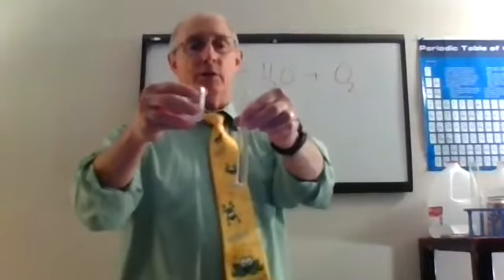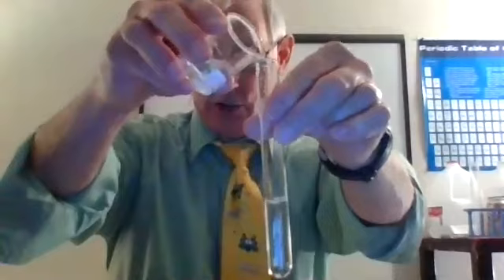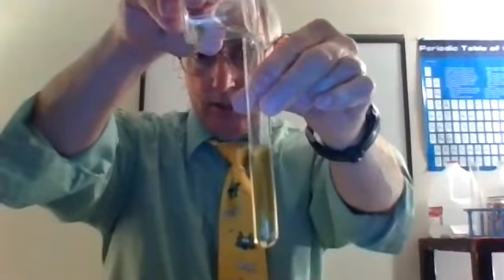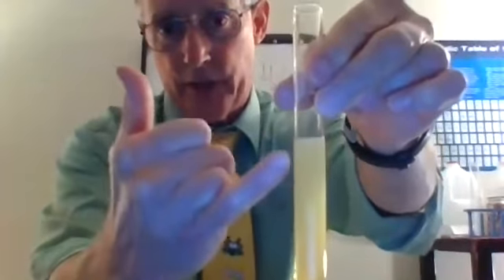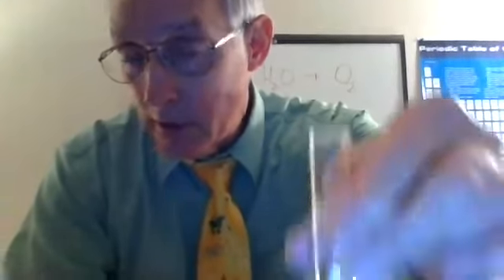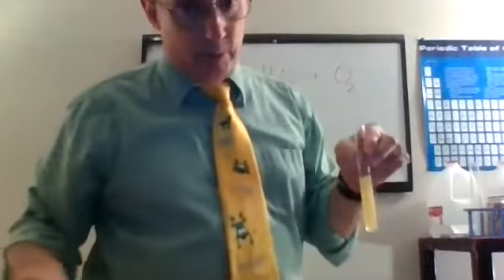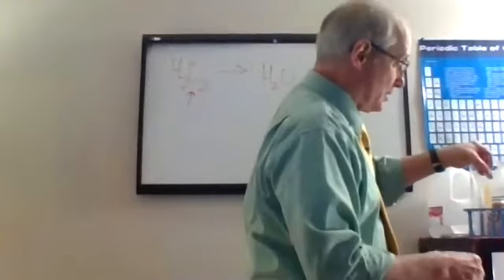But I'm going to go ahead and ask you to watch this and see if you see anything speed up about this reaction. When I put this potassium iodide in there, you see it turns yellow a little bit. But not only does it turn yellow, do you see all those bubbles that are forming? If you listen real close, you hear the oxygen coming off of there? That oxygen is coming out fast now. It was coming out slow before, but by using the catalyst, we can speed up the reaction. Let me show you how fast we can speed it up.